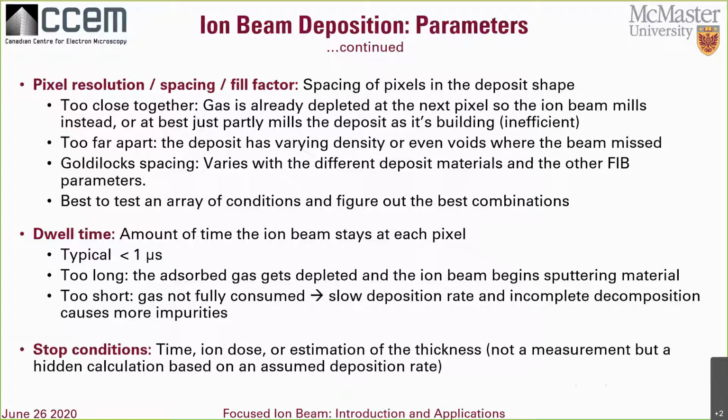If you want to get smaller than that, you have to go to a microscope that is no longer gallium, so a lighter element like neon or argon, or even helium if you want to get really tiny. We don't have one, I've never used one, but I think with something like helium, you could probably get well below 10 nanometers with an etched feature. And with other elements like argon and neon, it's probably somewhere in between helium and gallium, maybe just a couple tens of nanometers.